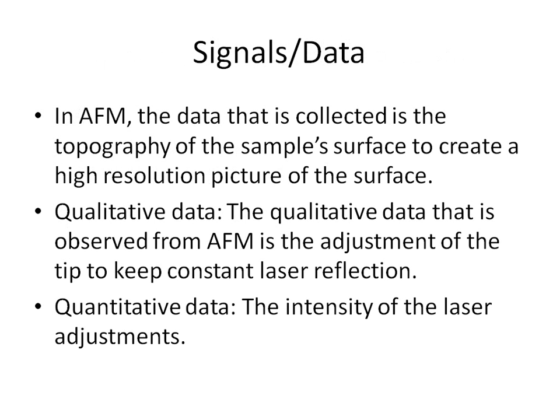In AFM, there are signals, or the data that you collect. The data that is collected from the AFM is an image of a sample surface. That's the main point we want to get across. We want this really high resolution image of this surface. This image is obtained by using a laser and a probe, like we've talked about, to analyze the topography of the sample and then plotting it to create a high resolution image that can be viewed.